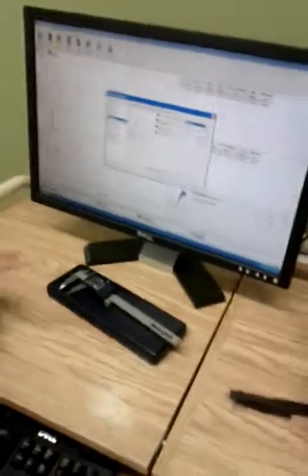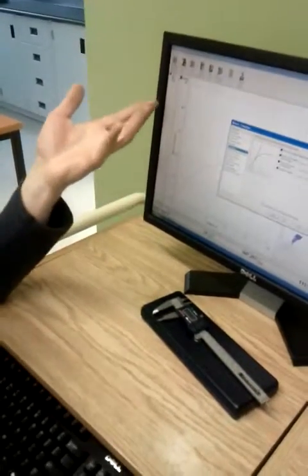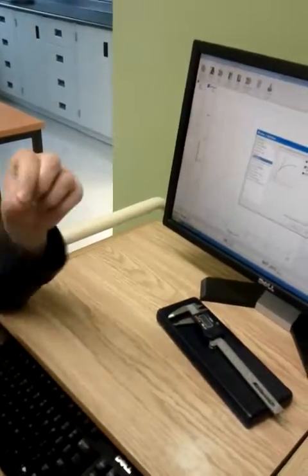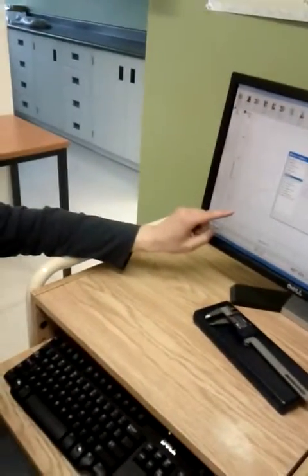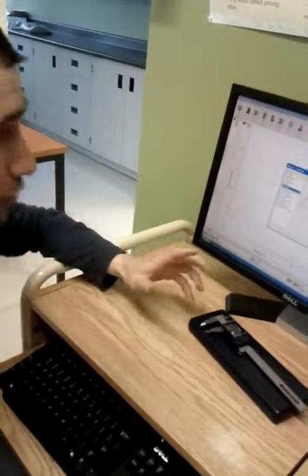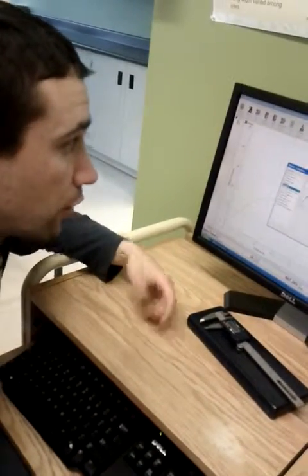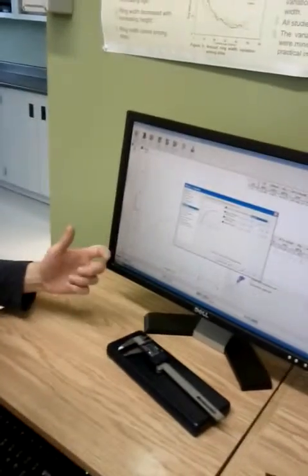Secant takes 2 points and draws a line, and it takes the slope. Tangent takes 1 point and calculates. I don't like this because if I take the tangent here, I could have 0 if I'm unlucky. But if you can take 2 points, it's better. I never tried regression. Whatever. I like secant, but it's up to you.